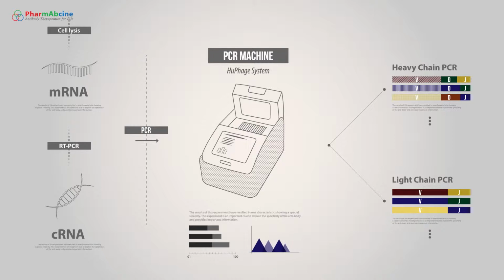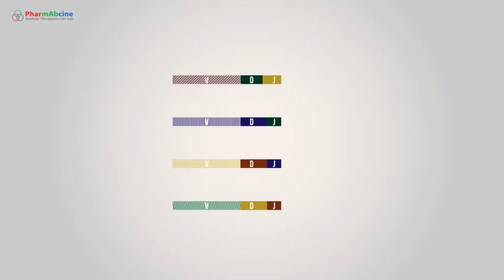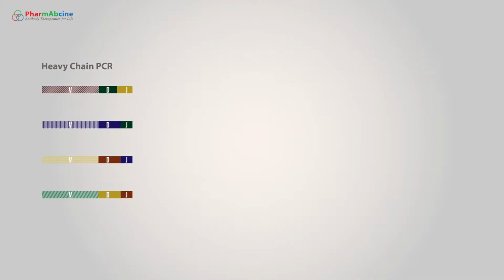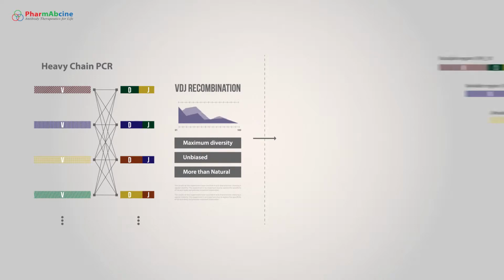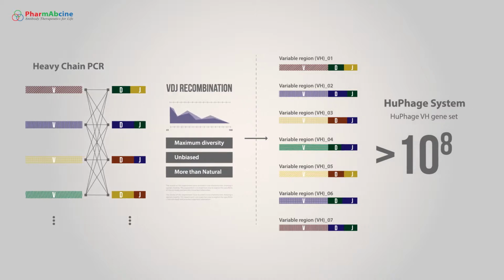Especially since the heavy chain area's variable region DNA is important for the specific bond between antigen and antibody, we maximize the variety of the DNA pool by amplifying the V segment and DJ segment of the heavy chain area's variable region, and engage in cross-fusion of them to obtain a variety of more than 10 to the power of 8.